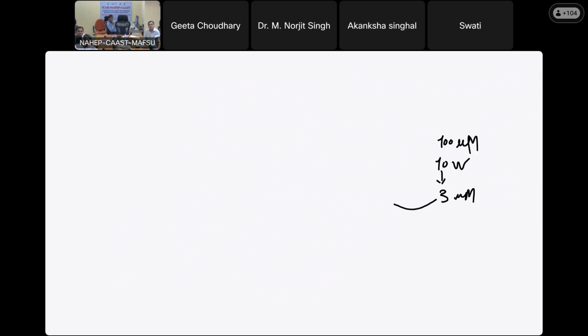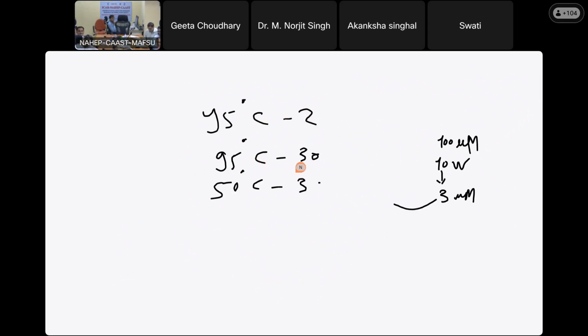So 95 degrees Celsius for 2 minutes, 95 degrees Celsius for 30 seconds, 50 degrees Celsius for 30 seconds, 72 degrees Celsius for 30 seconds to 1 minute up. But I have put 1.30 minutes. Okay. 50 degrees Celsius is your annealing. It is standard for all the primers.